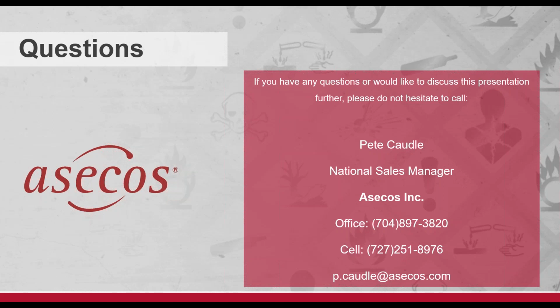First question is from Scott Shreenan. Do you have a recommendation for air changes within a storage room and a storage cabinet?